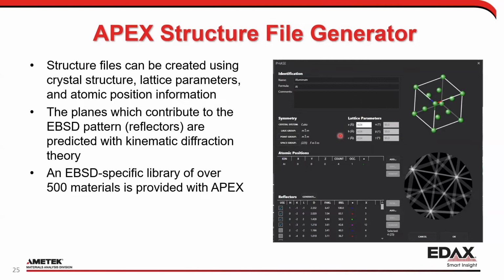You need to get this usually from some other information. So this is where XRD would come in handy. You'd figure out your atomic positions, et cetera, and then it would add a reflector list for you to use. This reflector optimization is a little bit more complicated, but we generate this reflector list based off of this information, and from that you can go ahead and do this.